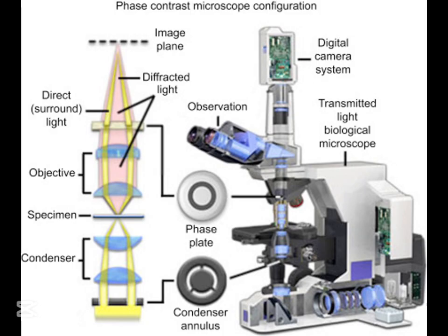Absolutely. Okay, so first things first. What exactly is a microscope? I mean, obviously it lets us see really small things, but how small are we talking? Okay, so imagine you're looking at an ant. You can see its legs and its antenna, maybe even its eyes if you look closely. But a microscope lets you zoom in even further. You could see the tiny hairs on its antenna or even the individual cells that make up its body. Whoa. Things like bacteria, fungi, even the cells in our own bodies. That's pretty amazing. It's like a whole hidden world.